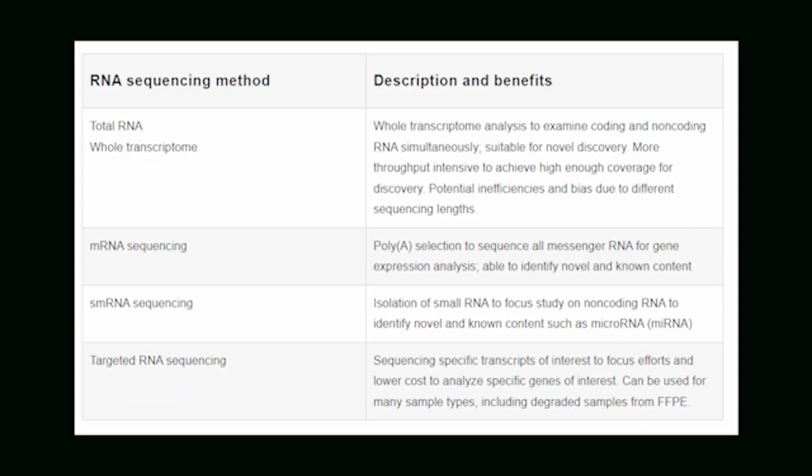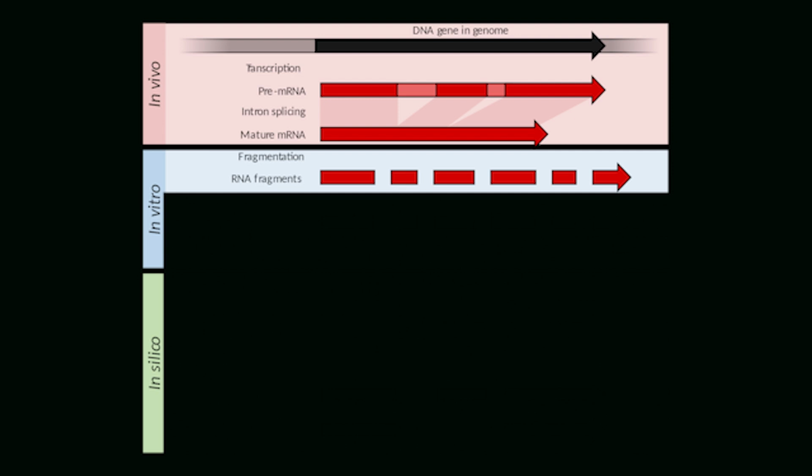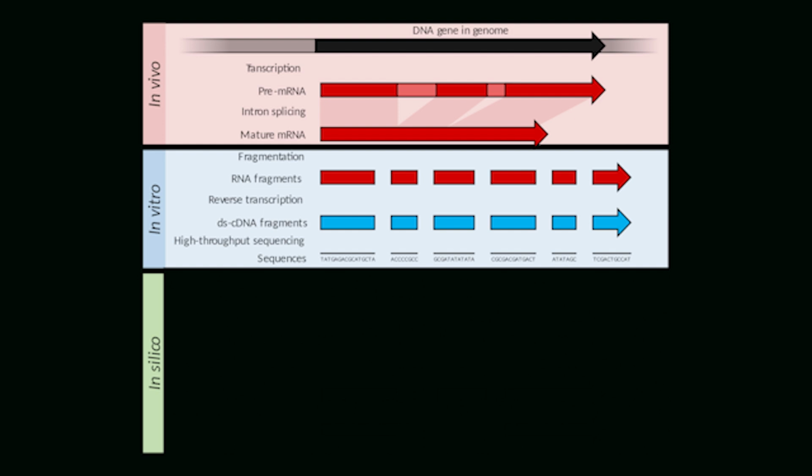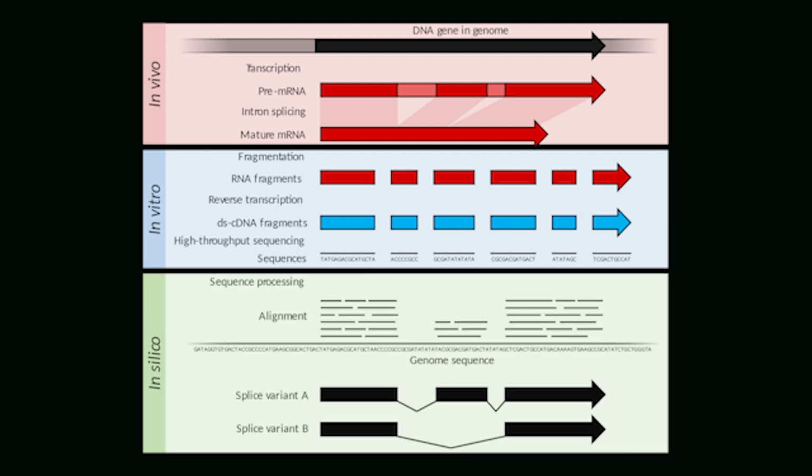There are many variants of RNA-Seq which modify the method in order to select for specific types of RNA, control for biases, or provide additional temporal and/or spatial information. The general workflow is relatively standard. It consists of the fragmentation of RNA molecules, conversion to cDNA by reverse transcription, high-throughput parallel sequencing, alignment to a reference genome, counting the reads, and then finally, analysis.